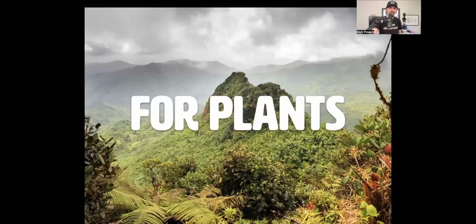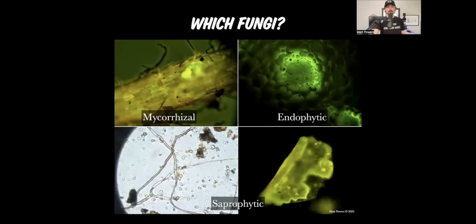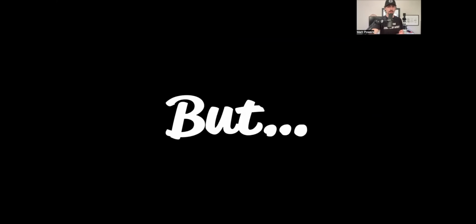Let's begin. So, did you know that for plants, the fungi that matter most are actually usually invisible to us? So you're like, which fungi, man? What are you talking about? Right? Because you may be looking at the saprophytes on the bottom and like, I can see them just fine. Well, there's another way to look at them. As you can see, there are two saprophyte images, and then mycorrhizal and then endophytic. So mycorrhizal is so incredibly important.